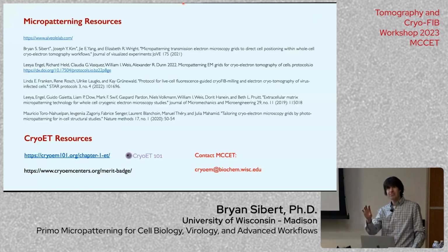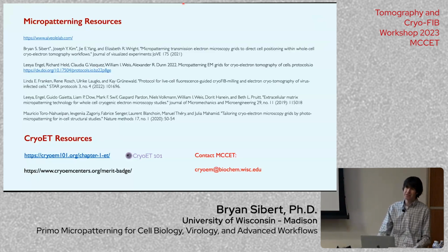And right now it's just ignoring grid bars. So it's printing like a circular pattern, but it would just be a matter of programming if you wanted that to only deposit in the center of grid squares. I'm not aware that that exists, but I think that kind of technology could be developed. And it would be interesting to see if anyone's working on that or what the future is there.